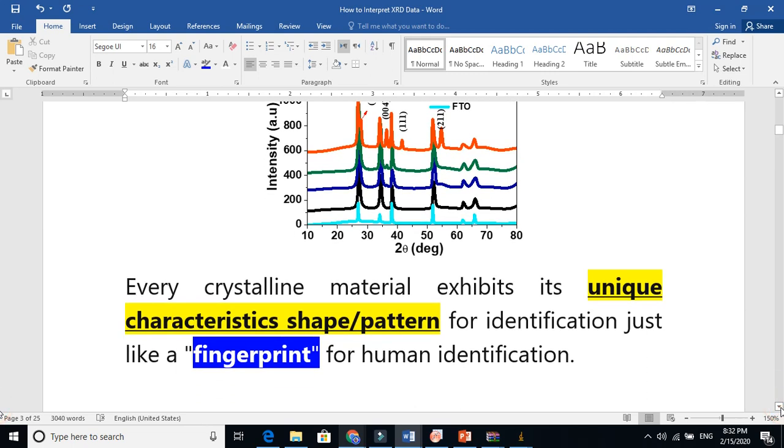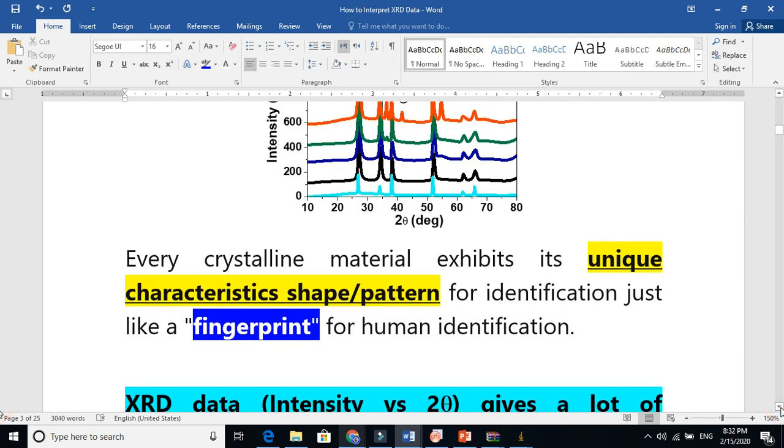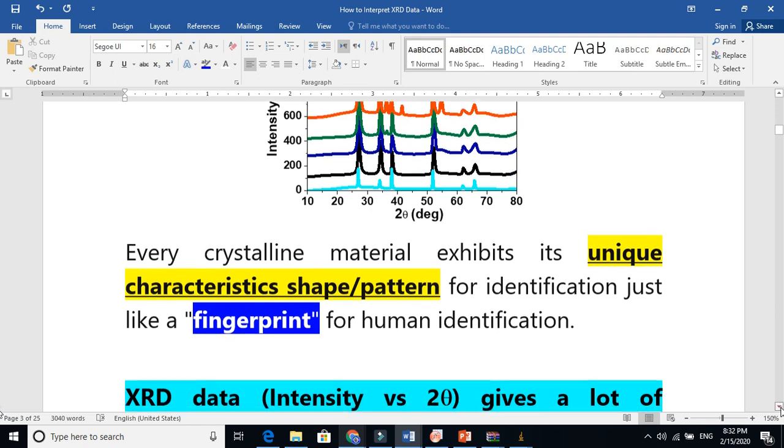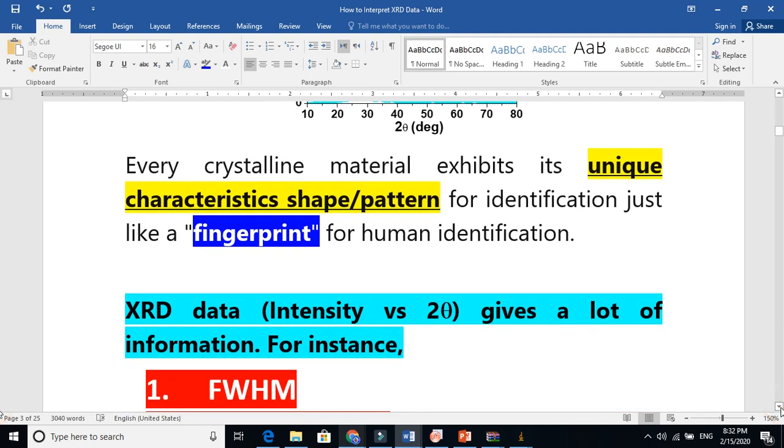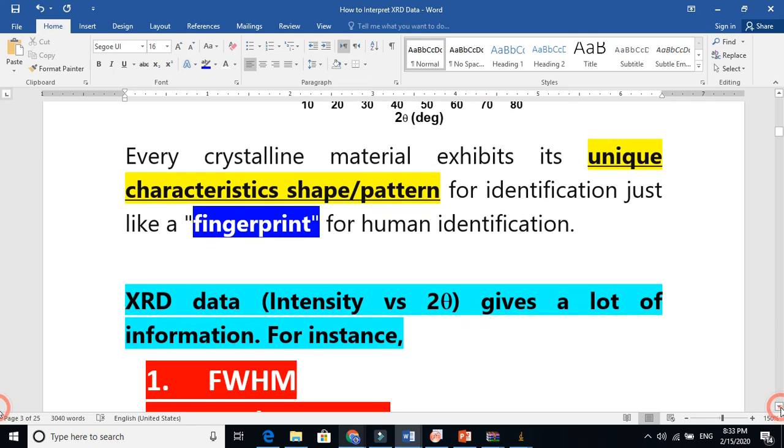If you take one sample and do the XRD, it will give a different graph. If you take another sample, another material, it will give a different graph. It is just like the fingerprint of a human being. The fingerprint we use for human identification. A similar approach, we use XRD for material crystal structure identification.